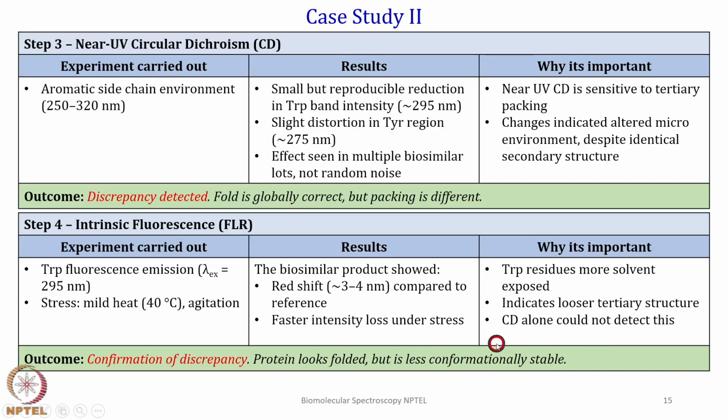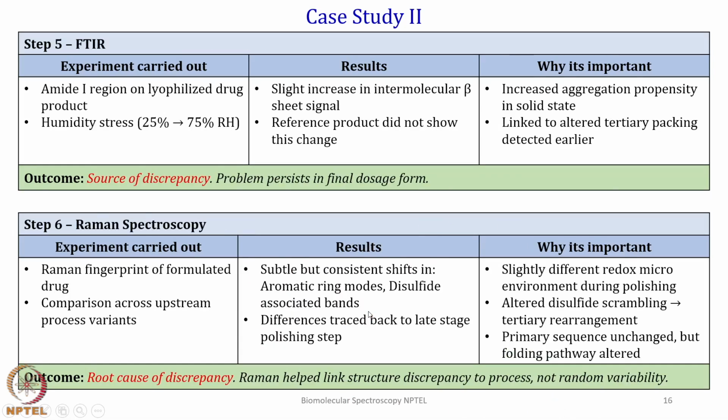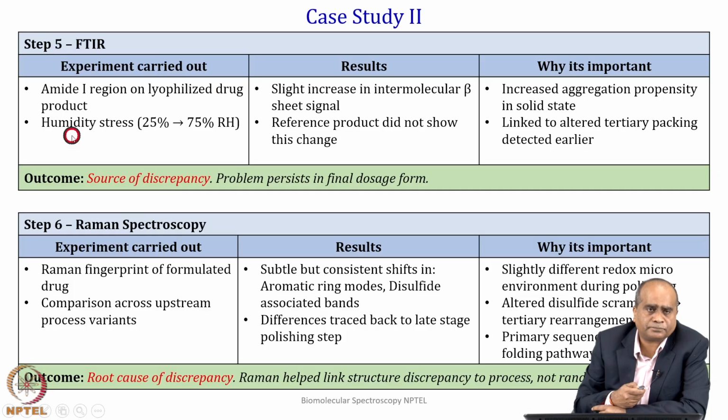We are confirming the discrepancy: the protein, although looking folded, is less conformationally stable. That is what one can detect, that whatever biosimilar a manufacturer is manufacturing, overall it looks fine, but it is not that stable. Next we move to the technique we discussed in this course, FTIR.